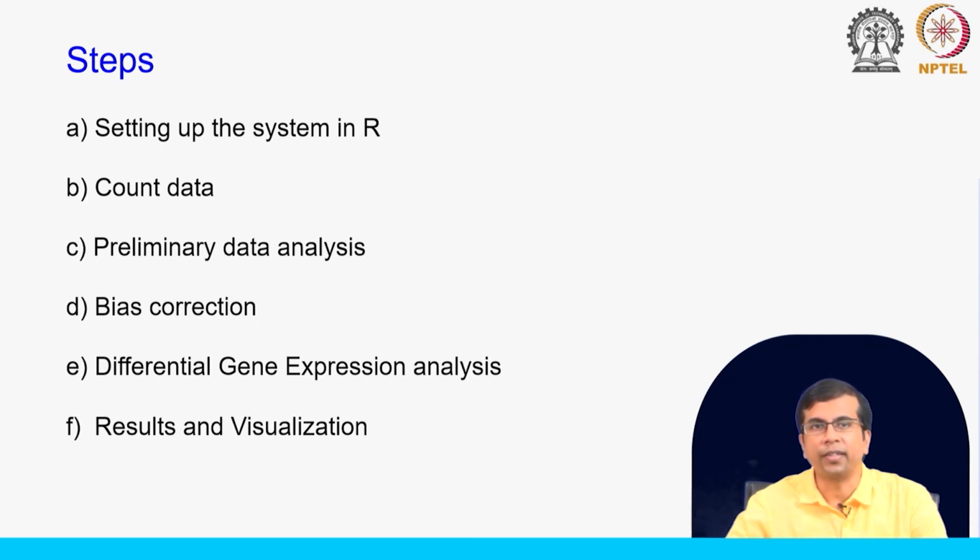Once we have generated the results from differential gene expression analysis, we will talk about how to visualize. So, we will see what kind of code we can use. I have shown you some of the visualizations, but in this hands on, we will write these codes to generate those visualizations, for example, the MA plot or the heat map.